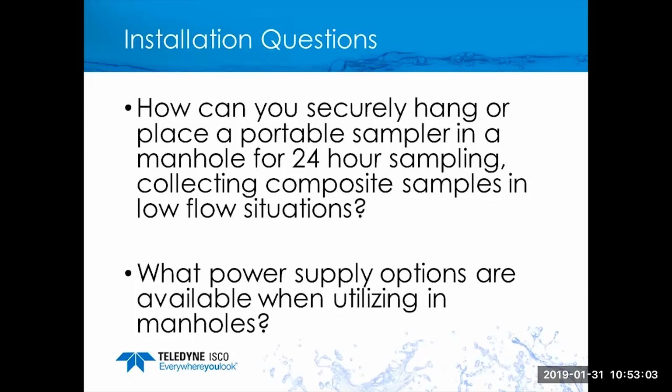Making sure that the sampler is level, that's very important also. We don't want it yawed one way or the other. That reduces the likelihood of our sample liquid spilling, also decreases the likelihood of our discharged sample liquid missing our bottles altogether. We also want to keep our operator in mind. So we have our sampler in place.